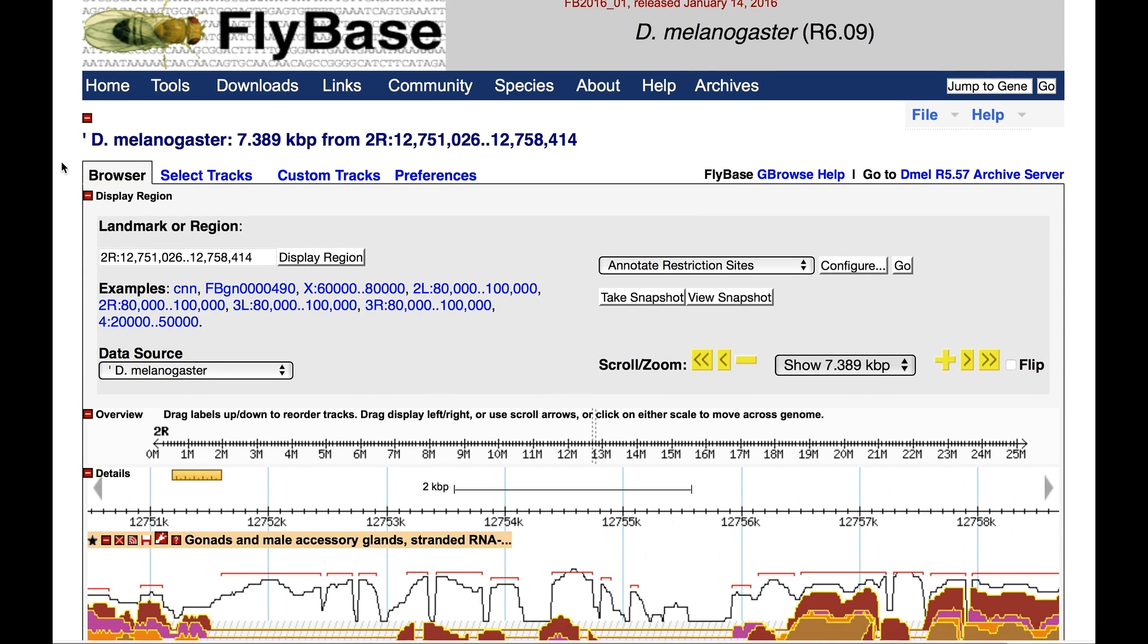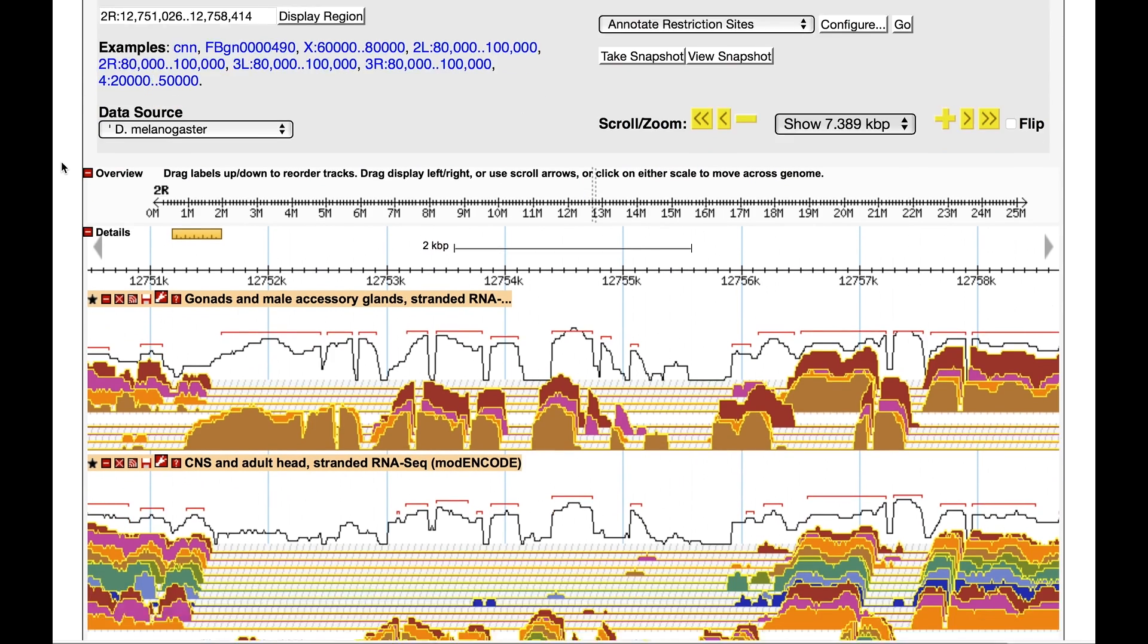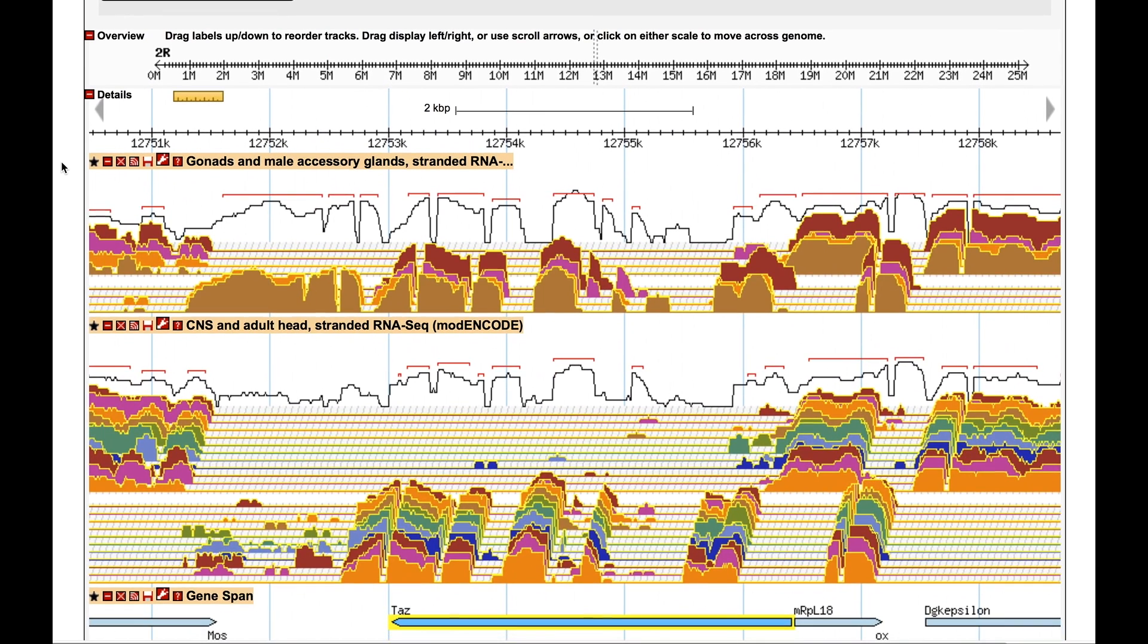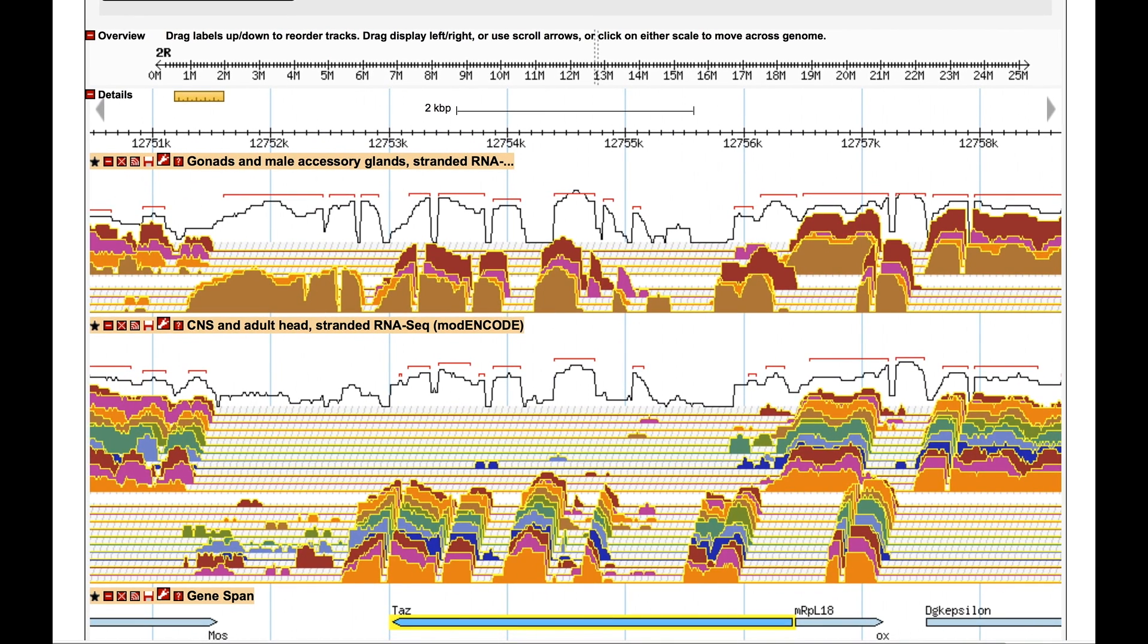You can see at the top of the page the two additional ARNESIC datasets that were just selected. Since these are stranded data, unlike the developmental stages previously shown, the ARNESIC is now divided into the plus strand and the minus strand for each dataset.